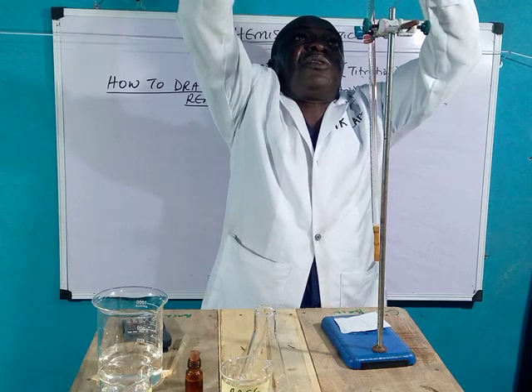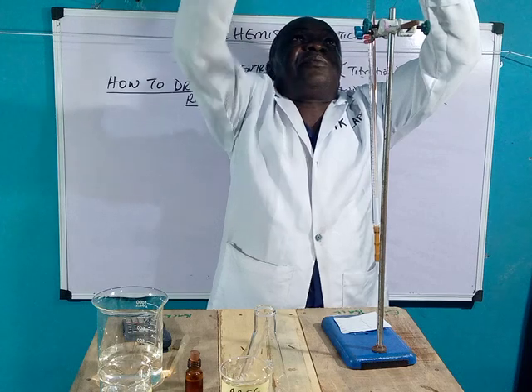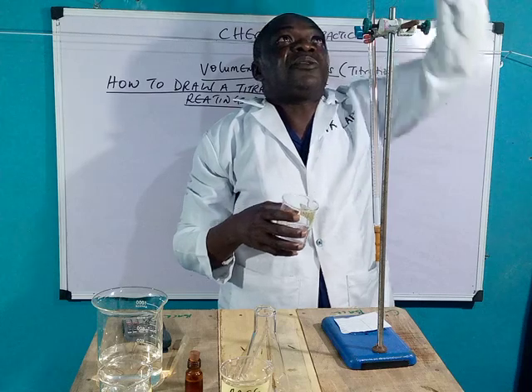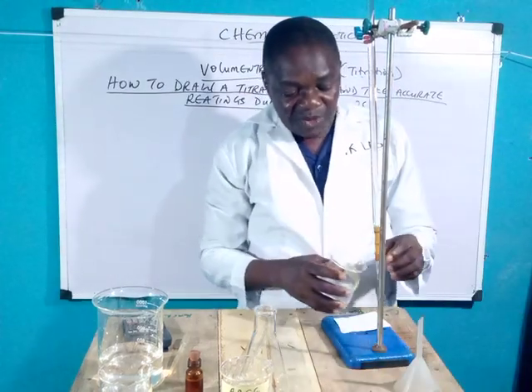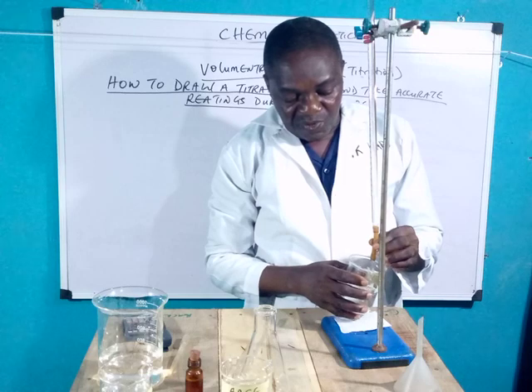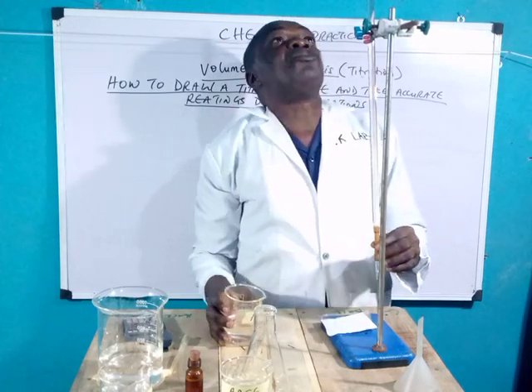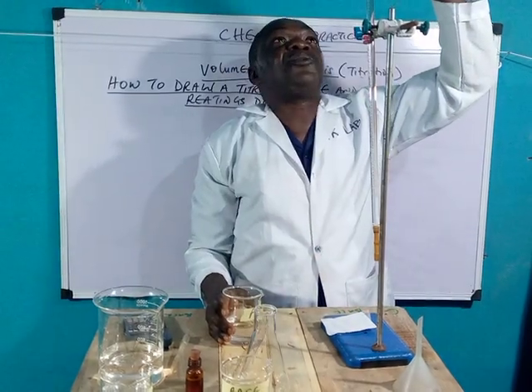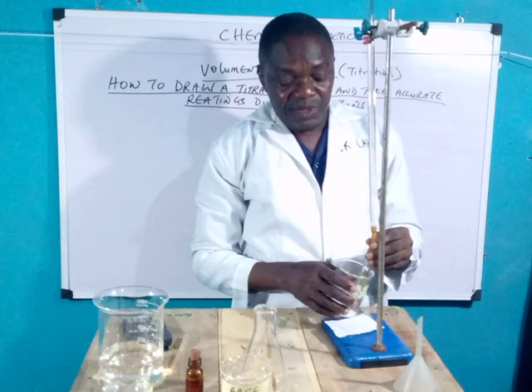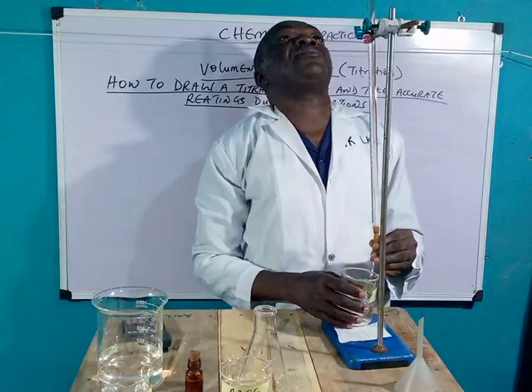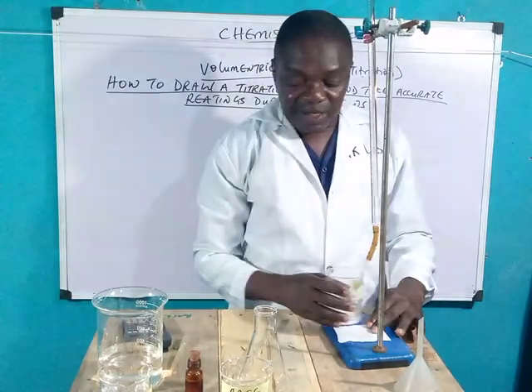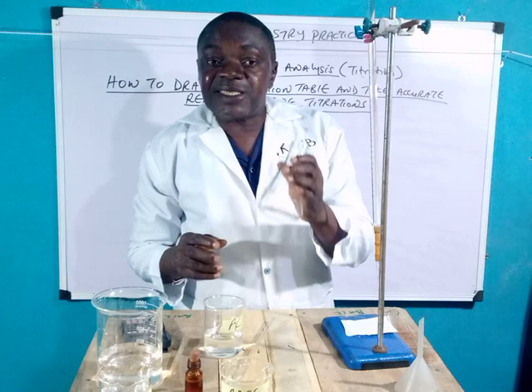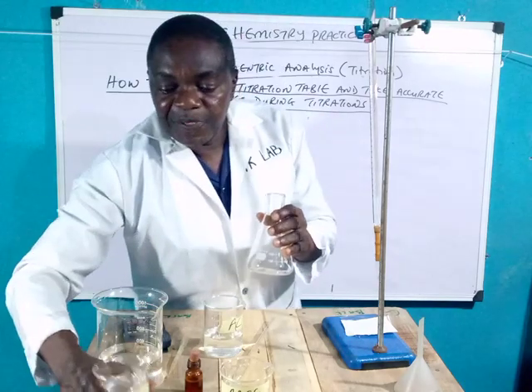Add to the zero mark while watching. It's already at the zero mark. The first thing you do is to remove air bubbles — there's always an air bubble here, so you flush it out. The air bubble is gone. Since we have removed the air bubbles but the level is still above zero mark, reduce the volume until you get to zero. It's at zero mark now. This is the conical flask — you do not rinse the conical flask with acid or base; you rinse with water; it must always be neutral.